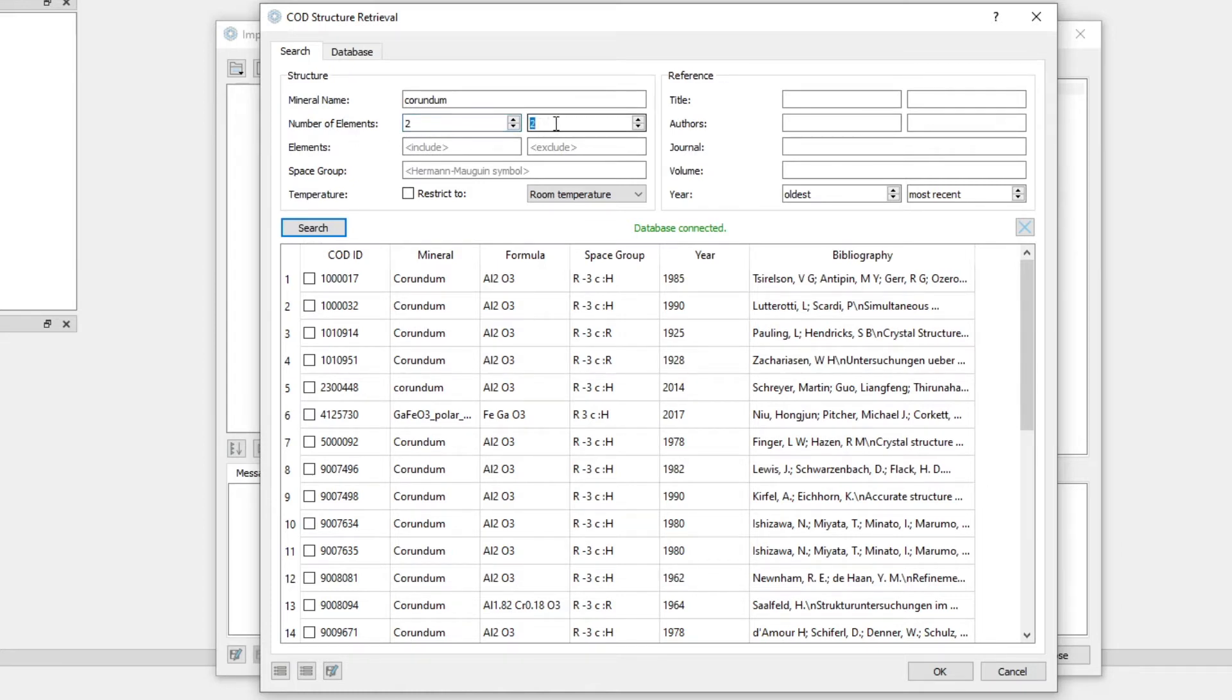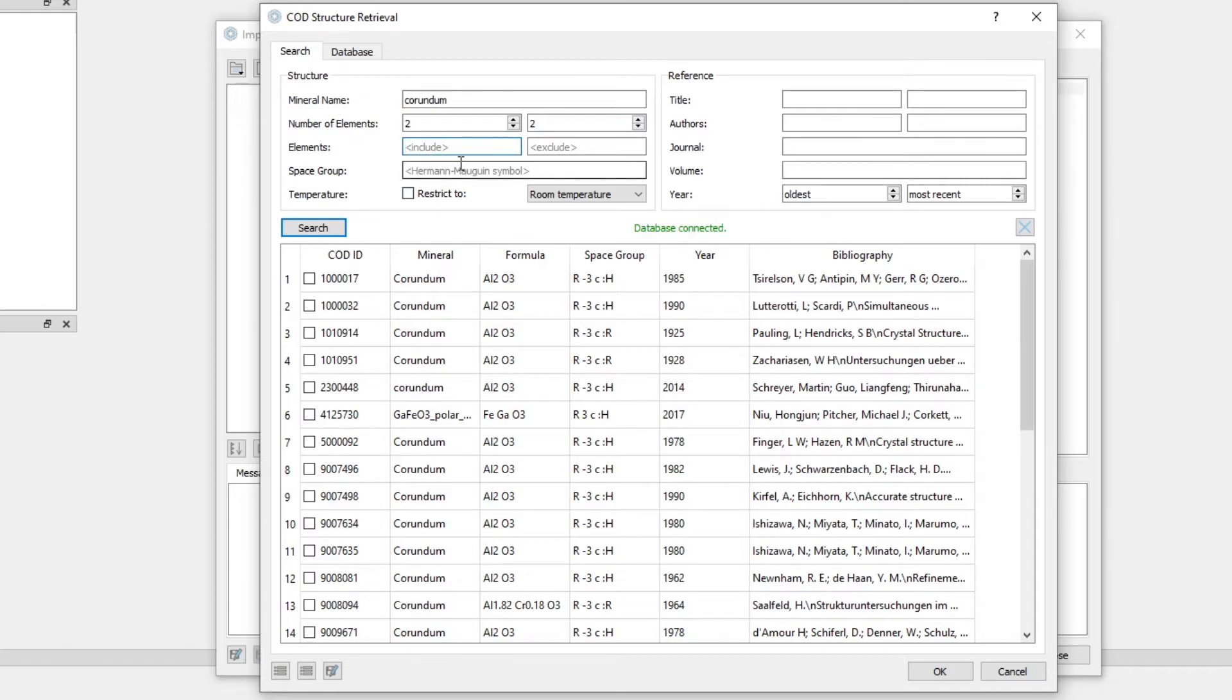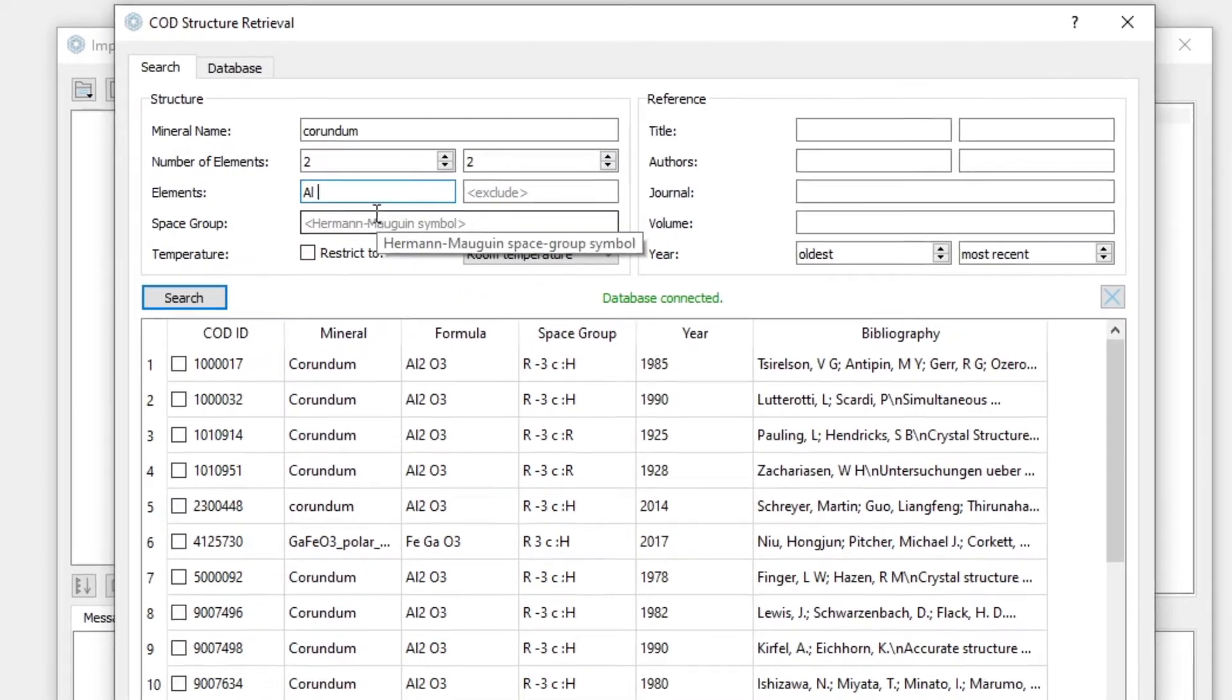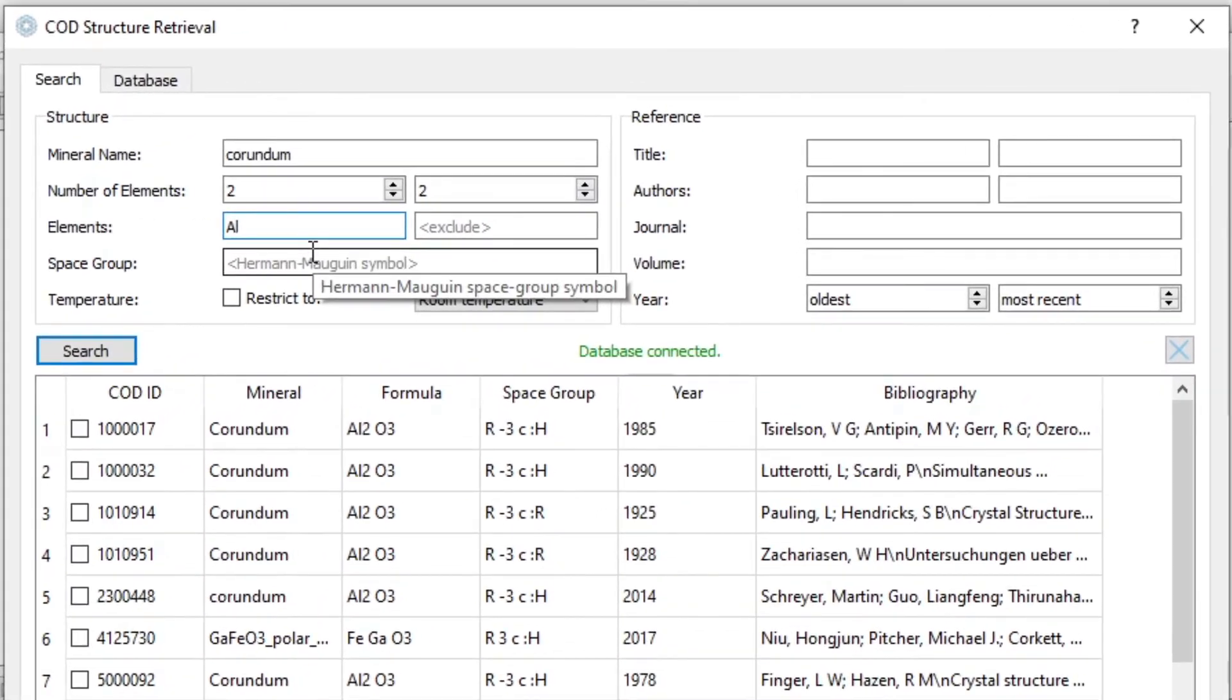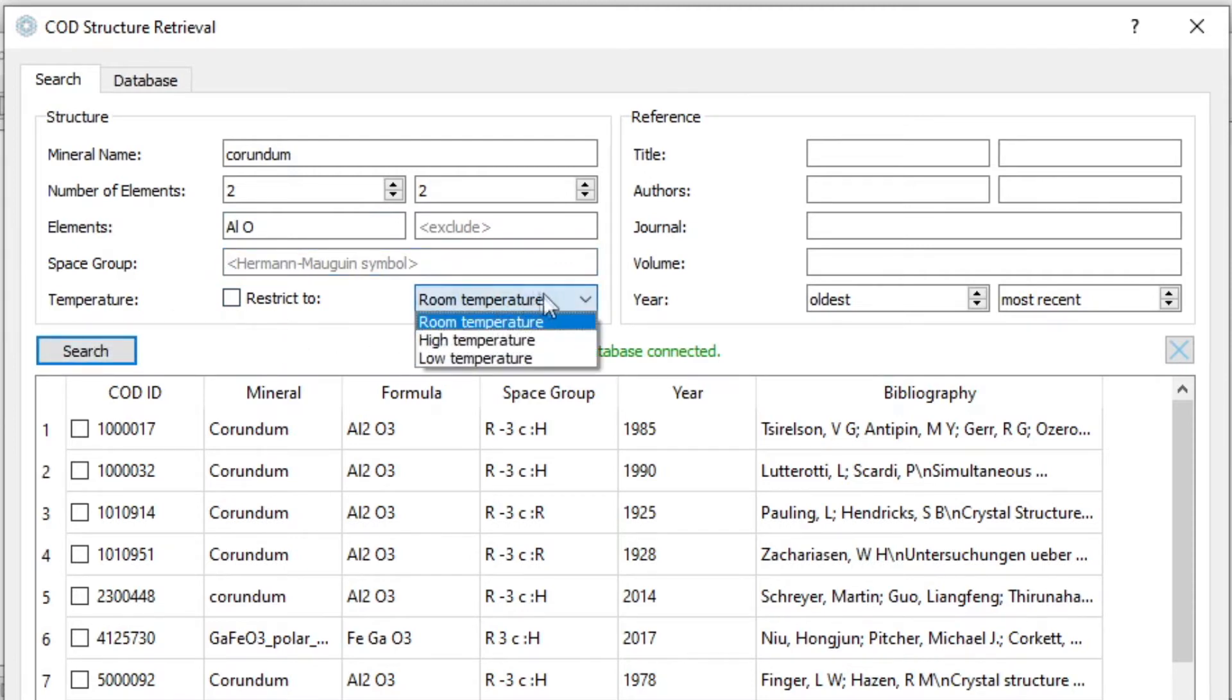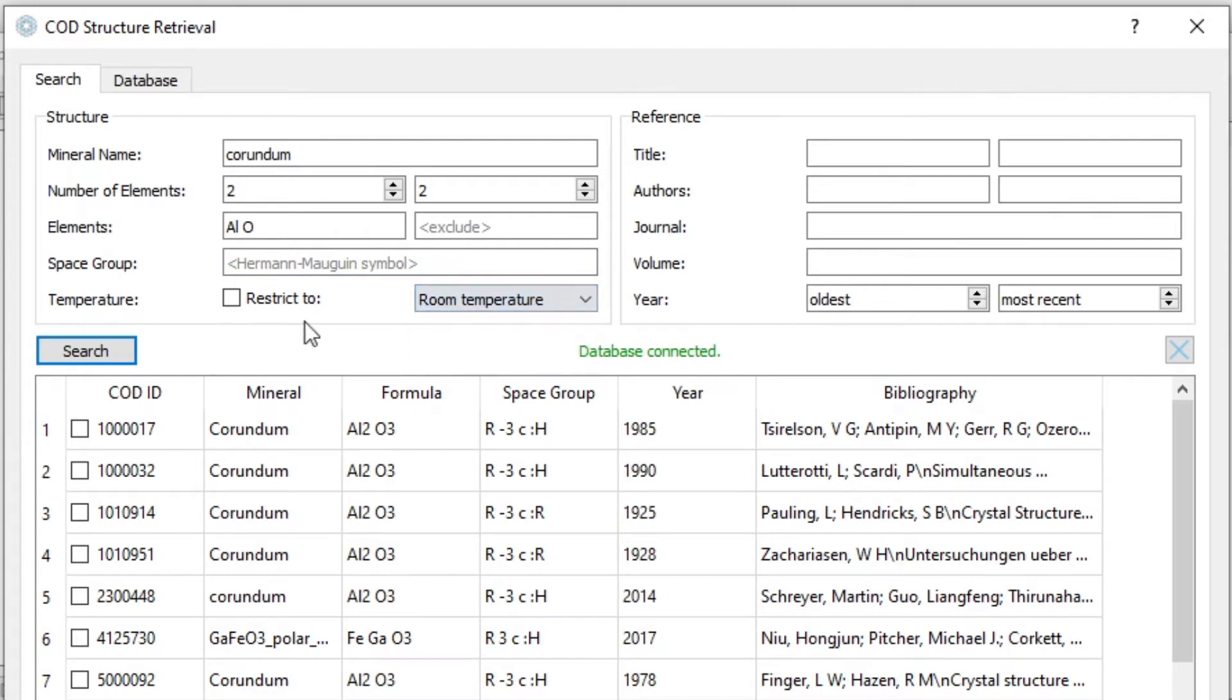In case of Corundum, we want two elements. We can specify a list of elements we want to include. This is a space separated list, so like this. We could also enter a space group symbol, and we could restrict the temperature at the time of measurement to room temperature or high or low temperature. We can choose room temperature.